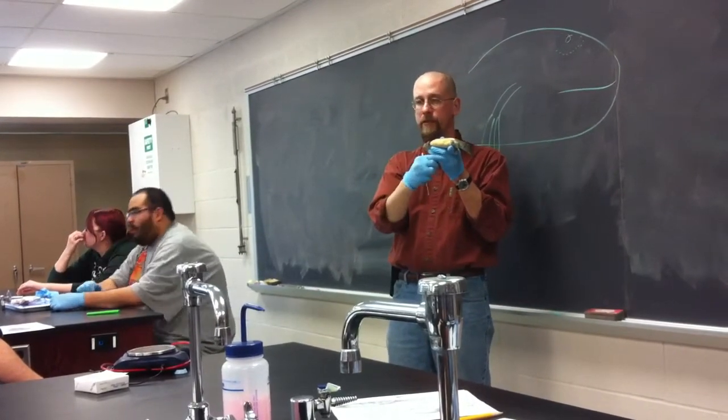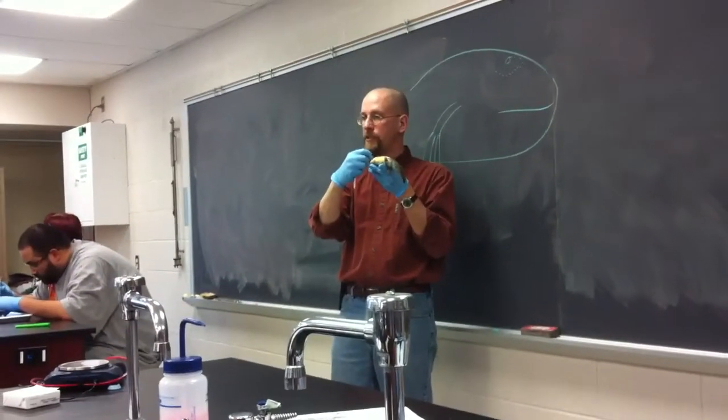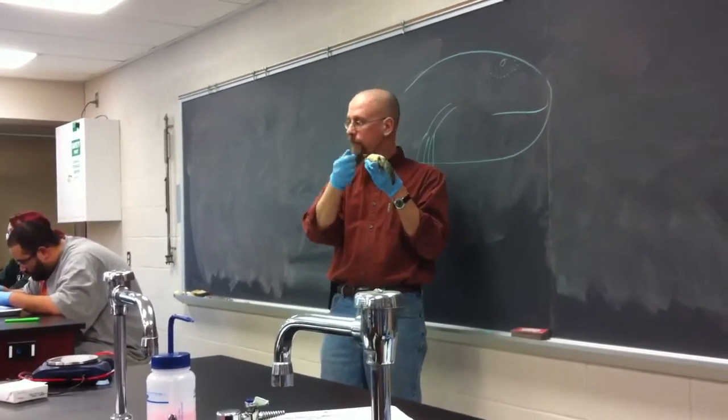External oblique, internal, transverses. Right? So carve away a couple of these myomere sections under that midline and find those layers.